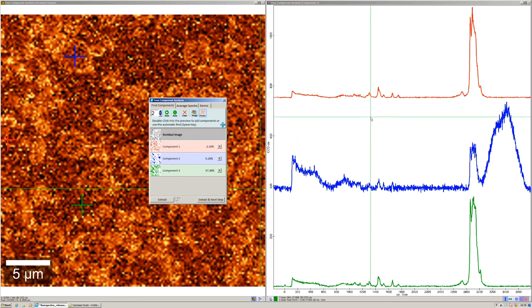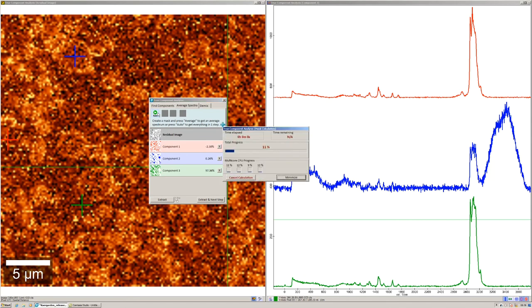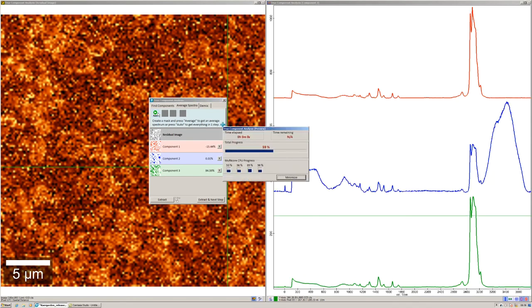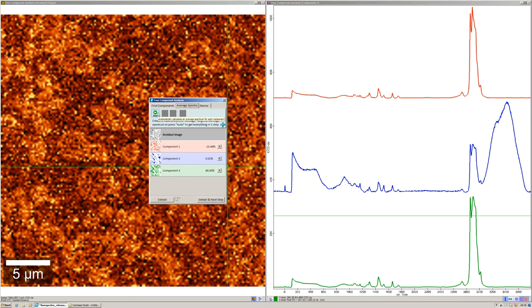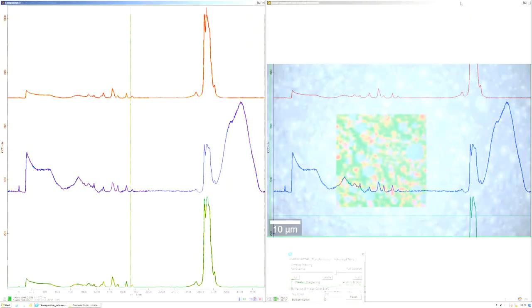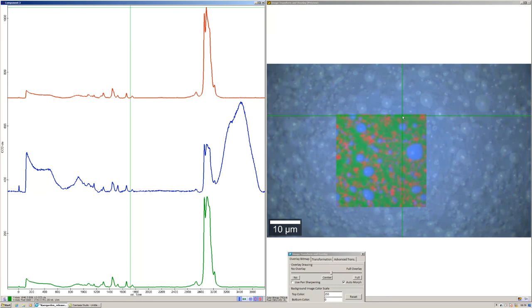Going to the next step to the average spectra allows me to automatically calculate the average for the spectra based on which spectra are similar in the dataset. With this, I have my average spectra for describing my entire dataset. So we see here the three different components.